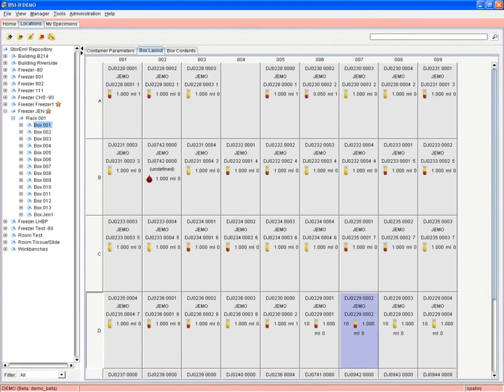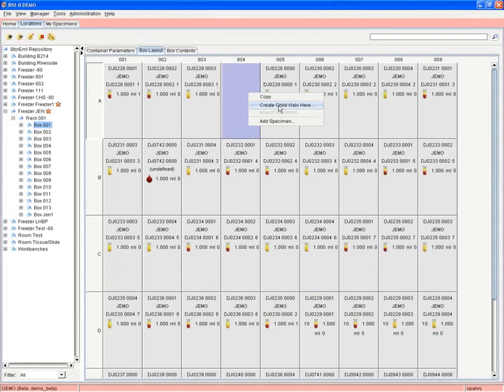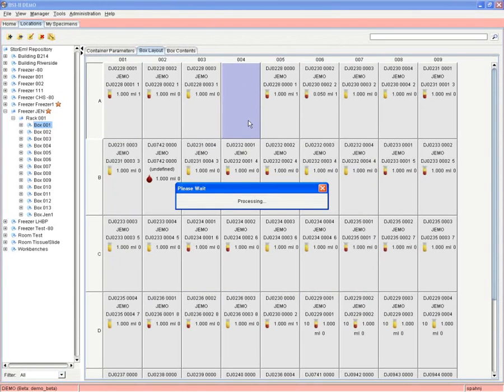If there are any problems with any of these tasks, what we'll do is we'll send you right to the requisitions editor, and you go through the requisition the old-fashioned way. Create child. Picked the wrong option.